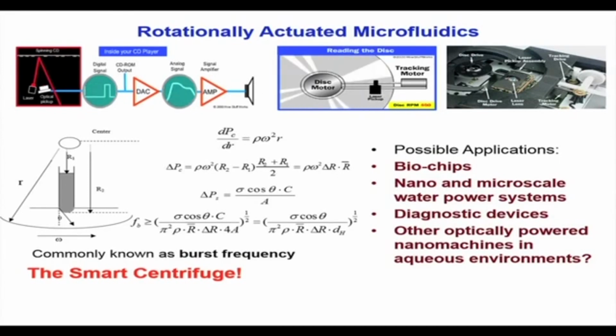Surface tension force might also be radially outwards, and if it is radially outwards then there is no control, that means the fluid will spontaneously flow on the disc radially outwards. There is no need to have such a platform, because then surface tension will spontaneously drive the flow, but you can use it as a control mechanism when the surface tension is opposing the radially outward force.